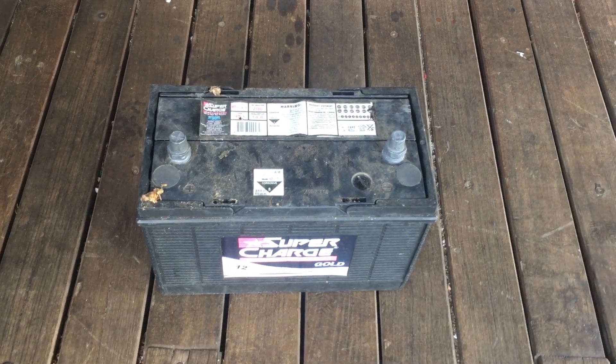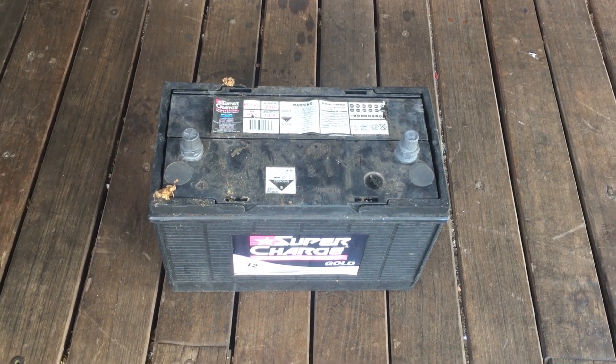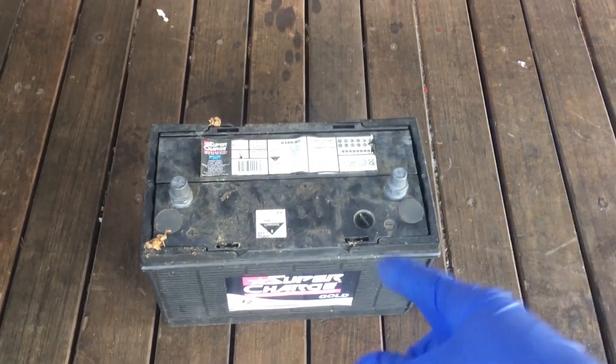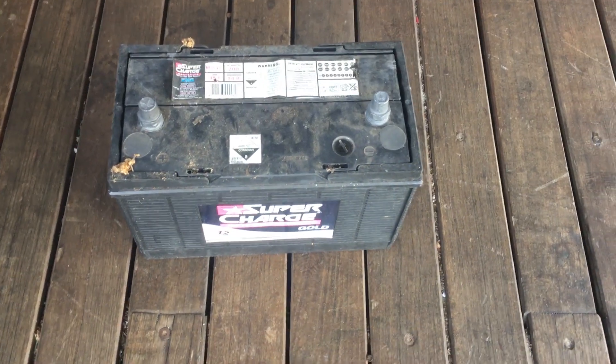I've heard lately that in the EU it's going to become a little bit more difficult to get hold of sulfuric acid, so maybe retrieving it from car batteries might be a viable option for a lot of people. The first thing we need to do is get inside the battery to get all of the acid out.